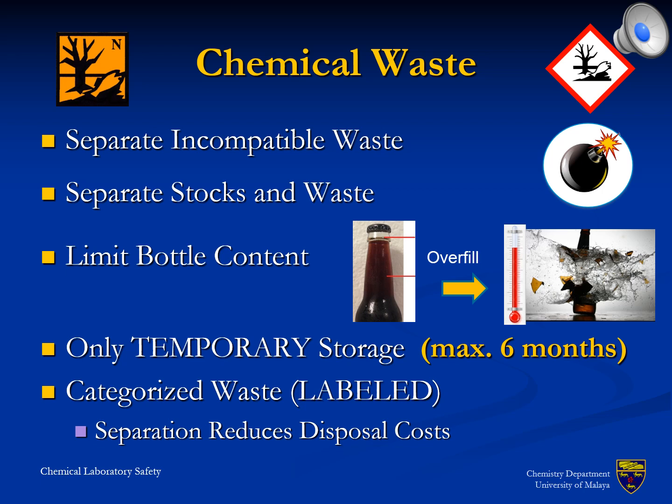Chemical waste must be stored in designated areas away from other chemicals. Containers have to be labeled according to the waste category immediately, and the date for the first waste collection has to be recorded on the container. The container must subsequently be disposed of within a period of maximum 6 months. Containers must not be filled completely with waste to avoid breaking upon warming. A 2-3 finger height reserved for air must remain.